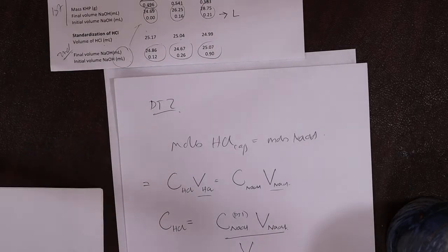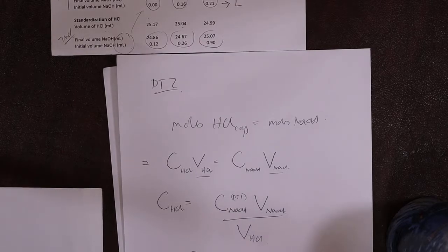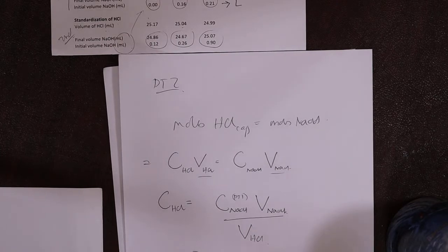HCl. Honestly, if you look back at your Chemistry 101 or even high school stuff, this is simple acid-base titration. What I want you to do in this first week is get, at the end of the day, the concentration of HCl. It should be 0.1 with 2 more significant figures. You might get 0.099 or something like that, but something around 0.1. That's how we figured it out in the work here.